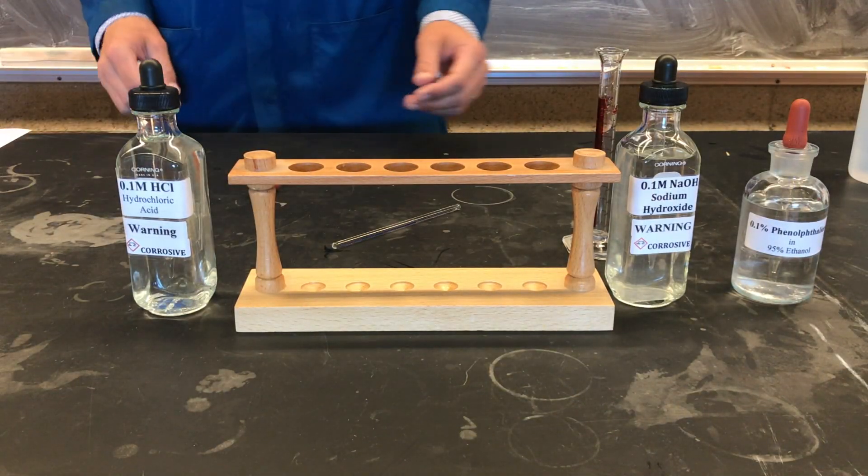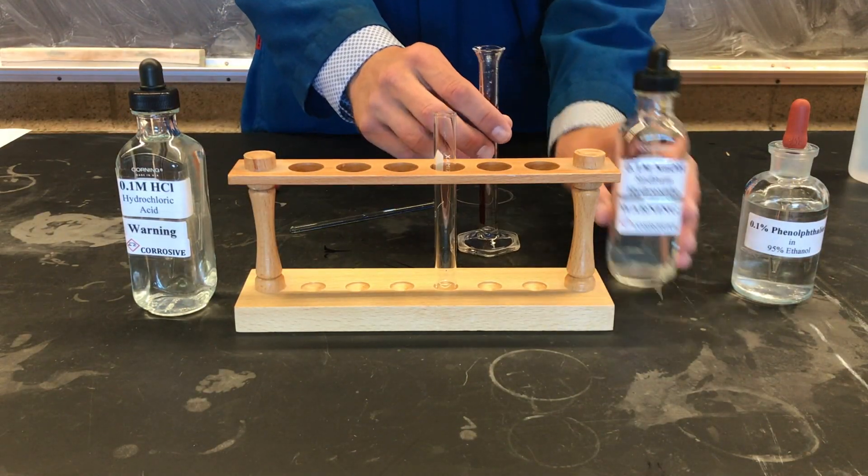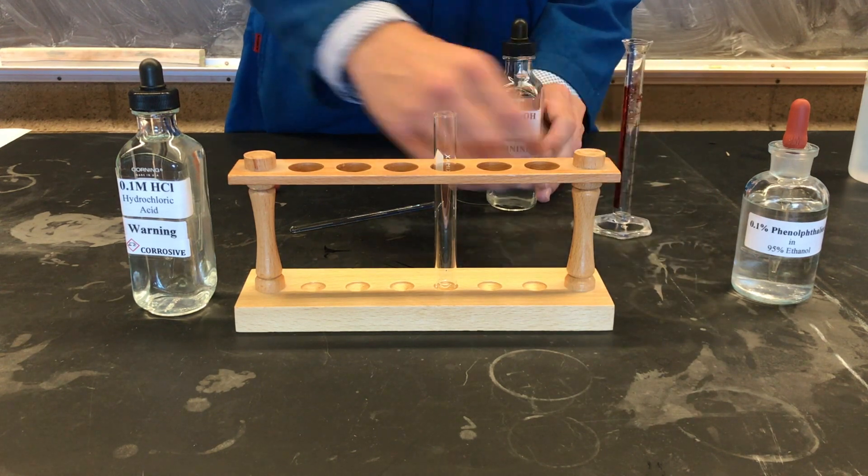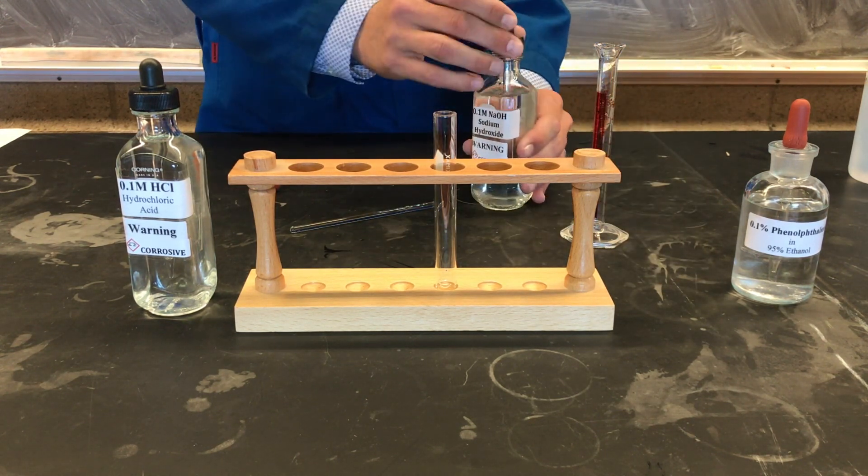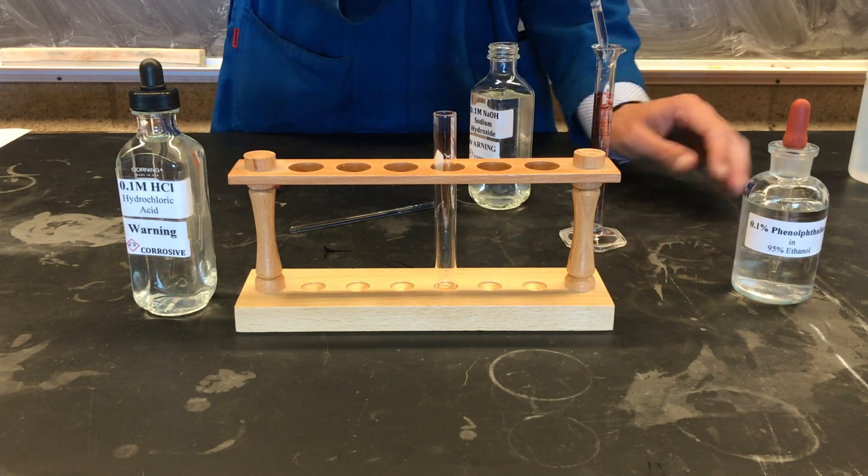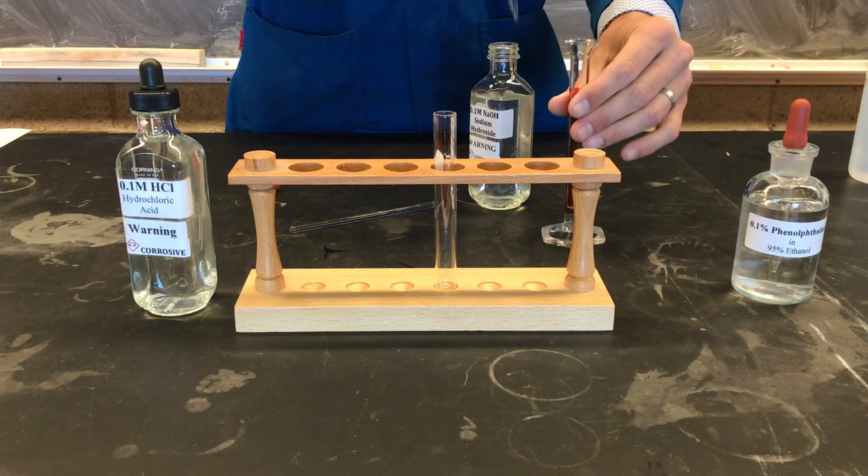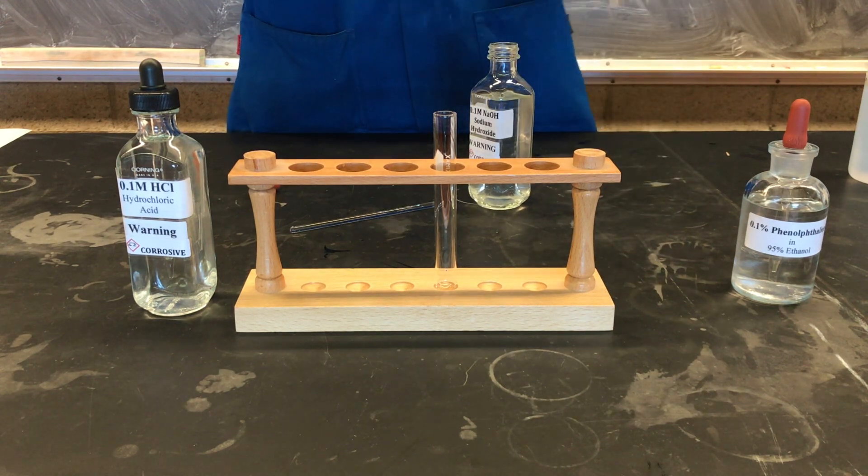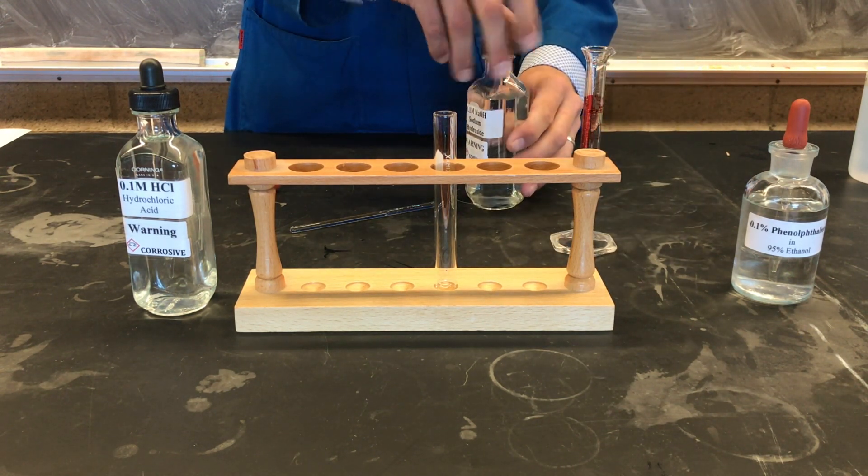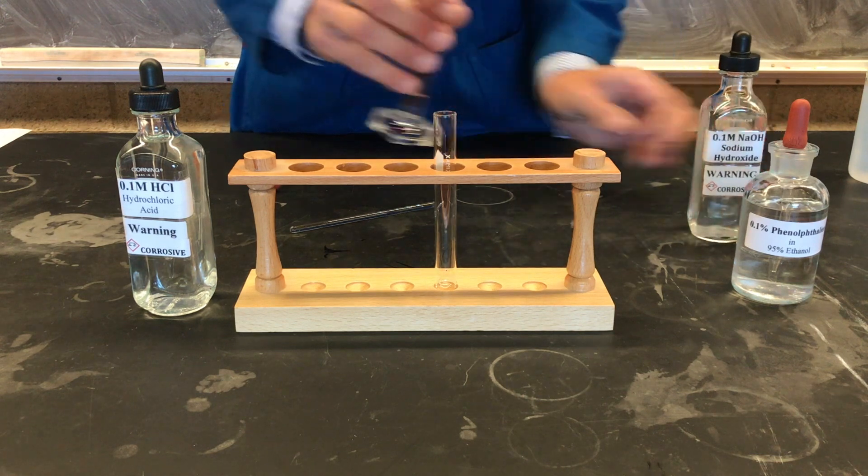In this reaction, we're going to be reacting aqueous hydrochloric acid with aqueous sodium hydroxide. We're going to add about 2 ml of our sodium hydroxide to a 10 ml graduated cylinder and add a bit to our test tube.